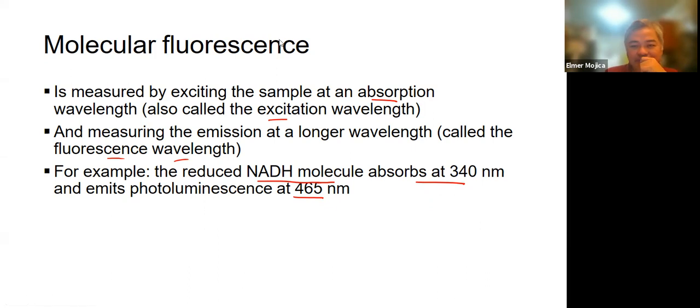Okay, so yung 340. And that's the reason why whenever you do fluorescent, you excite your material at higher energy, which means lower or shorter wavelength, and then observe emissions at longer wavelength. Because when you're doing excitation, you are applying energy, you are exciting the electron in your what we call system. So yun yung main reason doon.